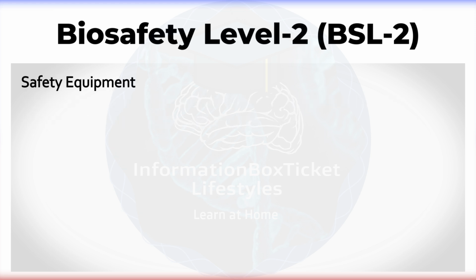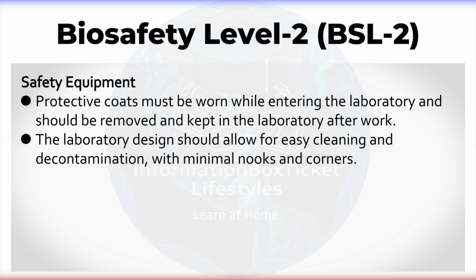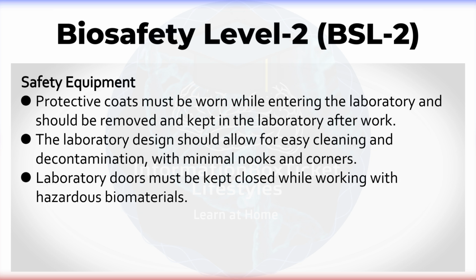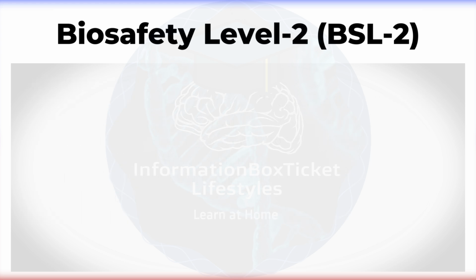Safety equipment. Protective coats must be worn while entering the laboratory and should be removed and kept in the laboratory after work. The laboratory design should allow for easy cleaning and decontamination with minimal nooks and corners. Laboratory doors must be kept closed while working with hazardous biomaterials. An autoclave must be available for sterilization purposes.